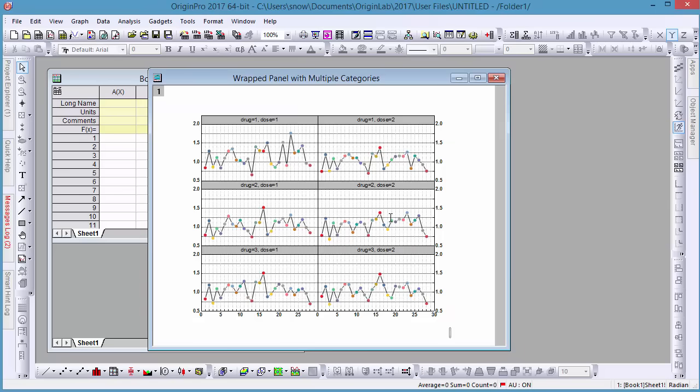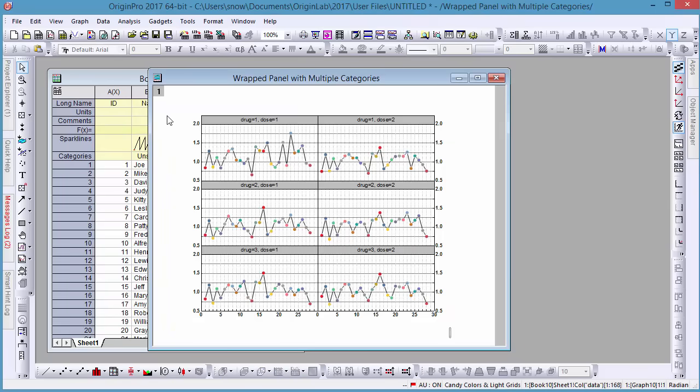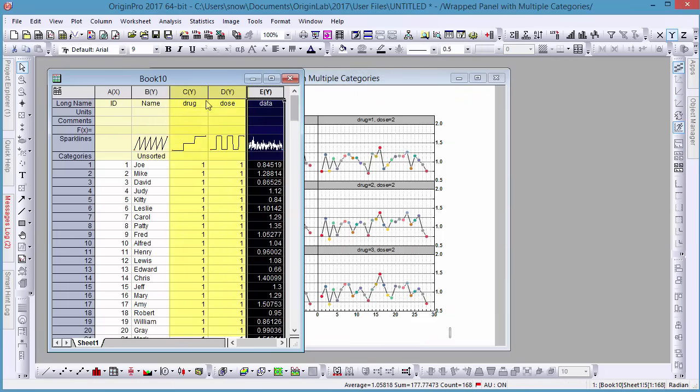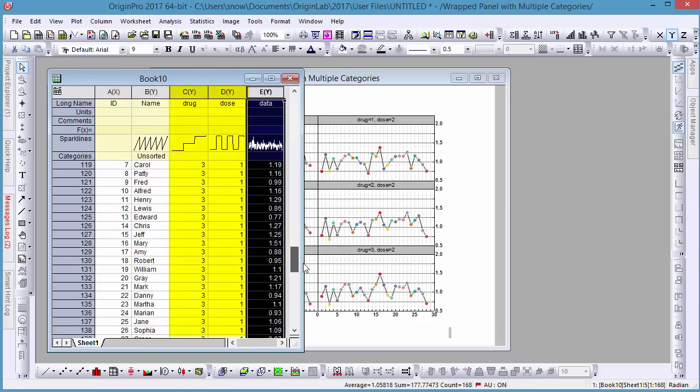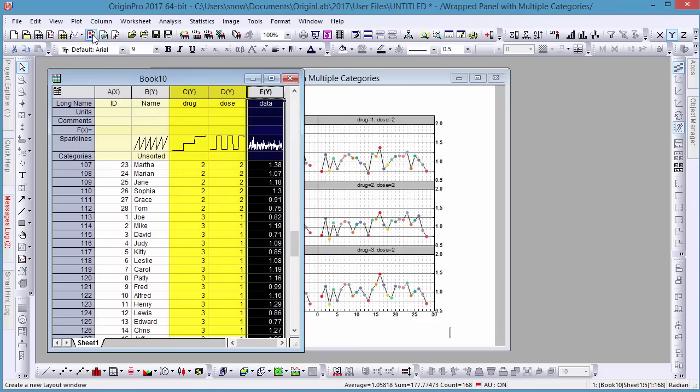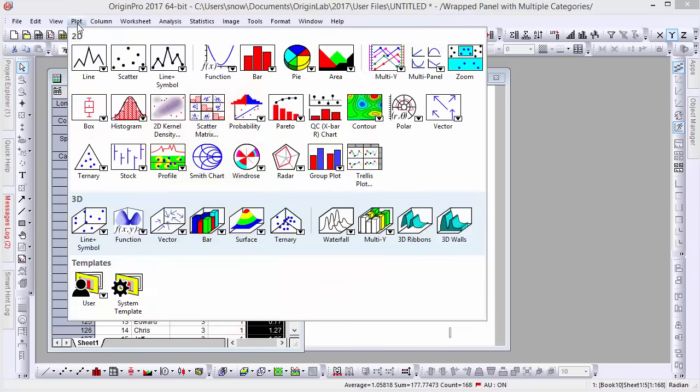Here we have different drug and dose values in columns C and D. To plot data grouped by drug and dose, we'll choose Trellis plot from the plot menu.